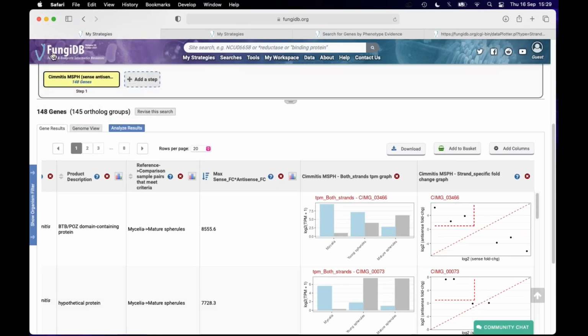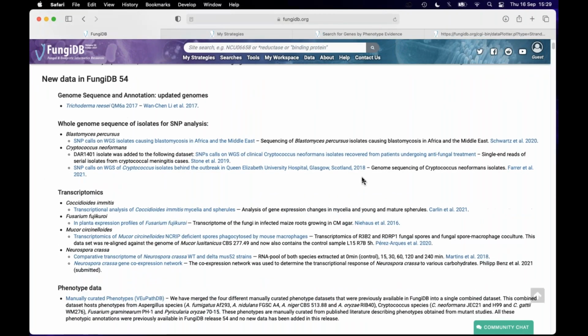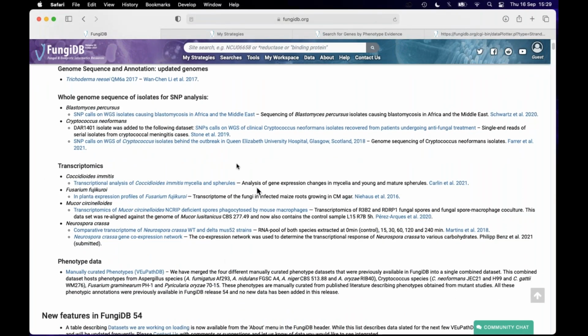And so coming back to the news. As I have mentioned, we have several RNA-seq data sets where the transcript can be searched using the various RNA-seq evidence tools that can help you mine this data.